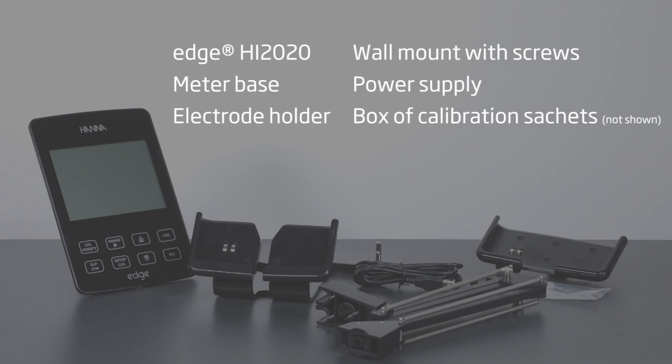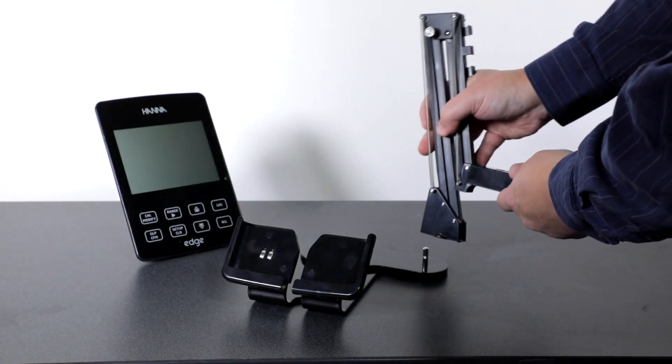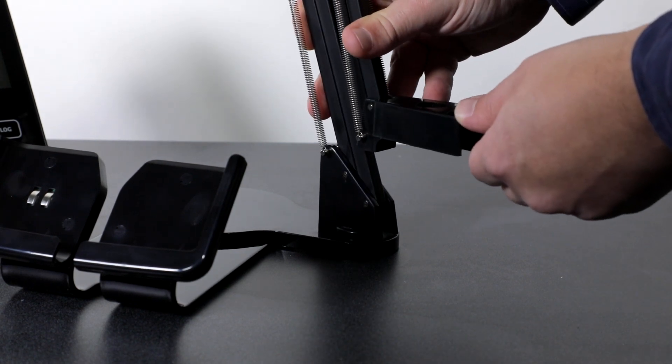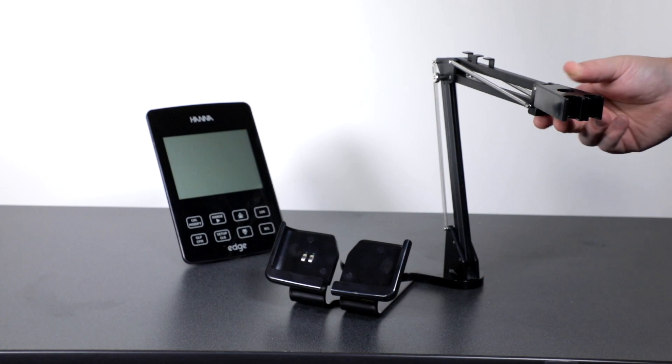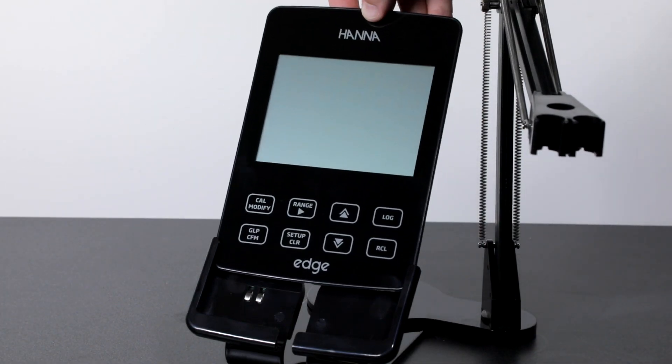Also included is the power supply and a small box of pH 4.01, 7.01, and 10.01 calibration sachets. To assemble the meter, place the electrode holder onto the pin located in the rotating section of the base, then put the meter into place.